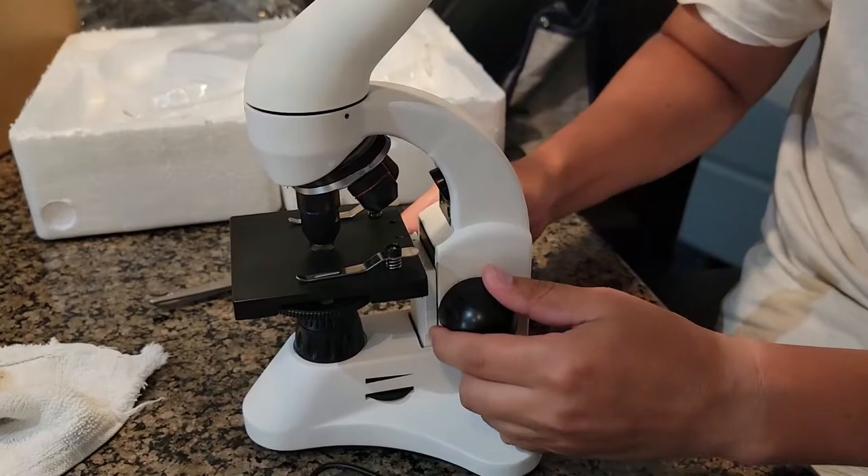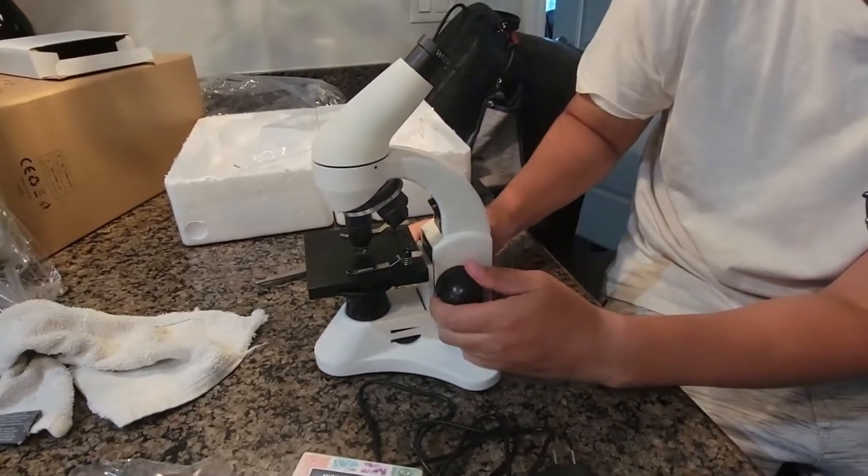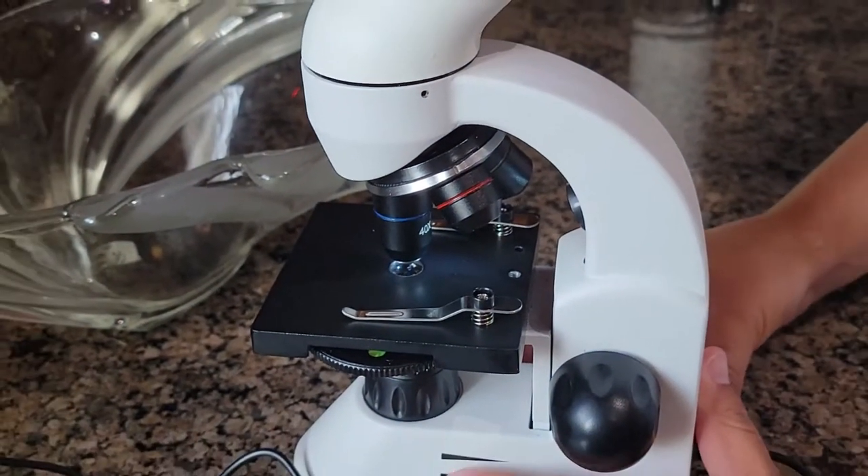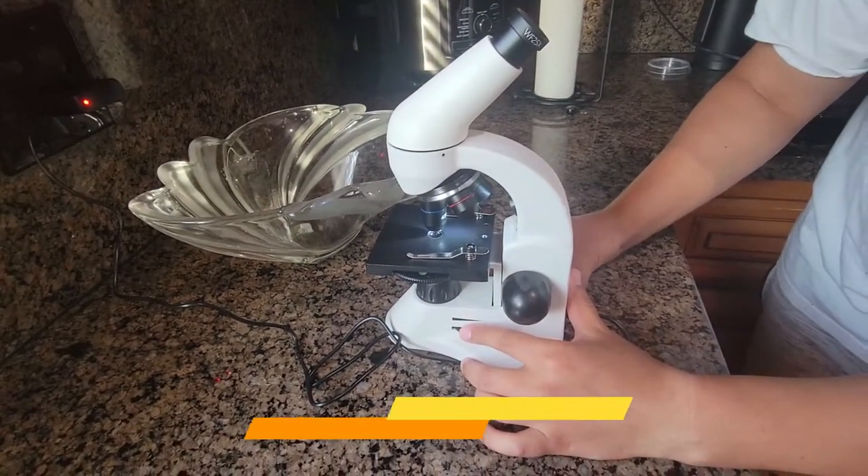This is to move the stage up and down to help you focus. So that's how you turn it on — you can change the brightness too.